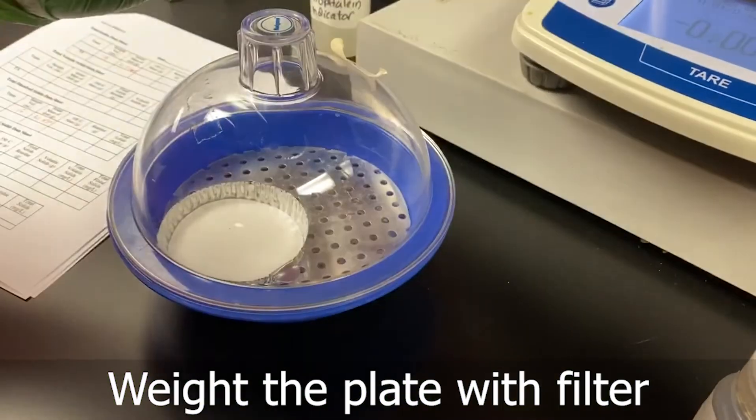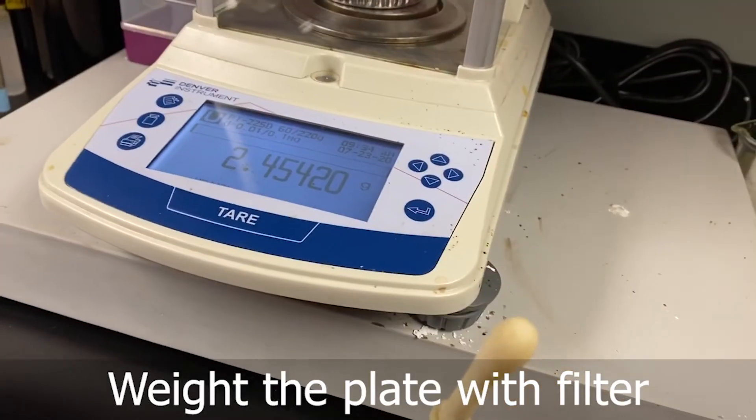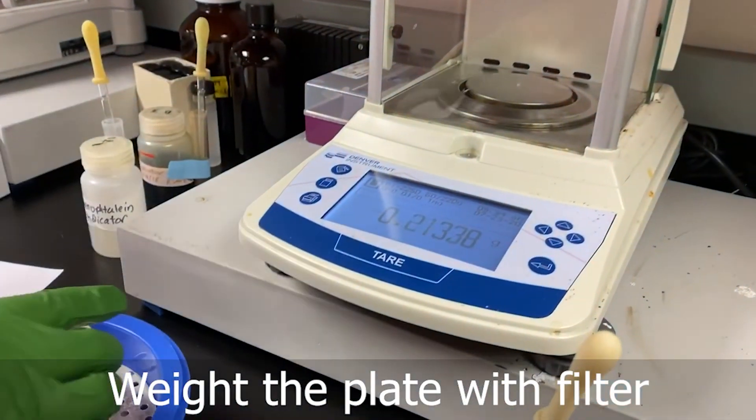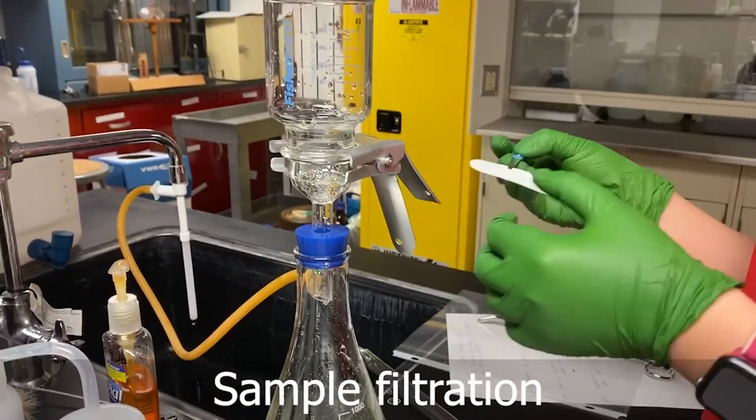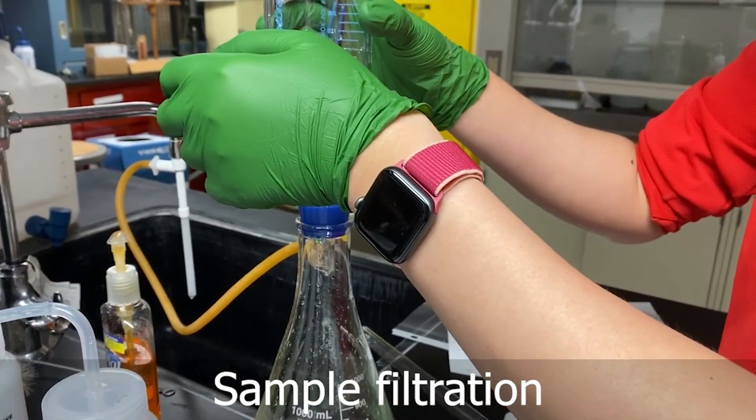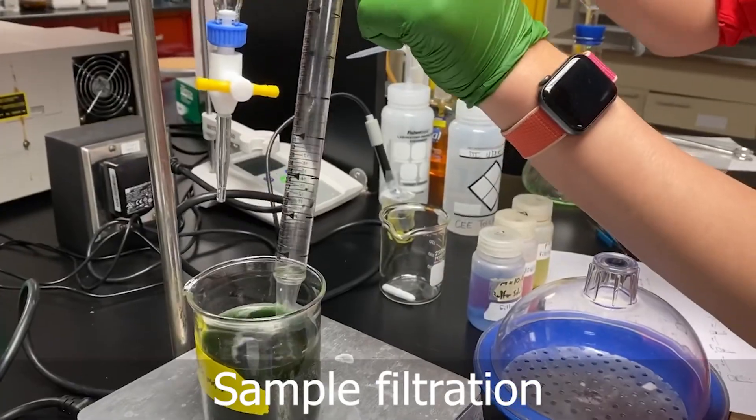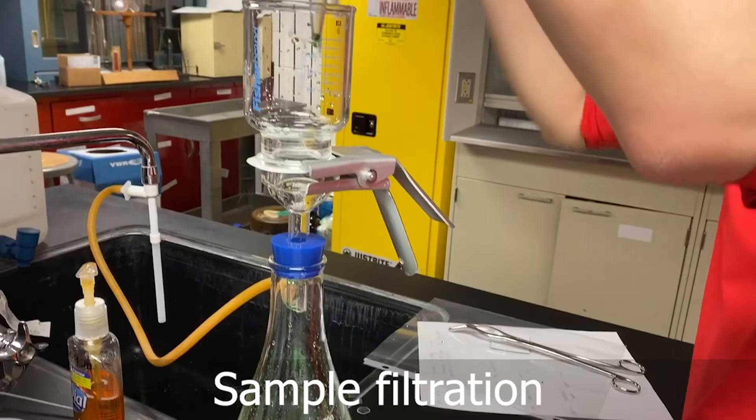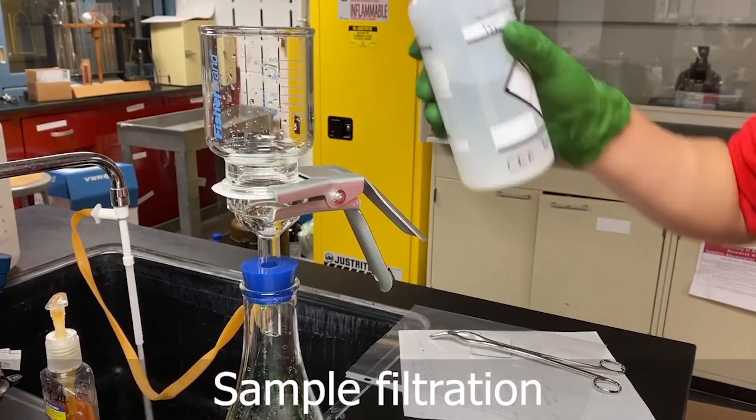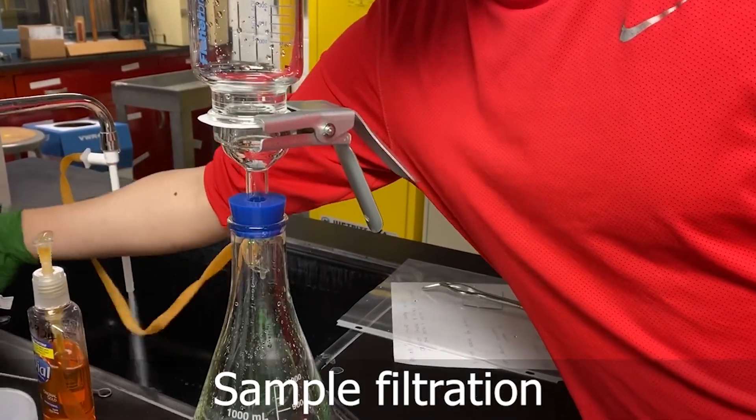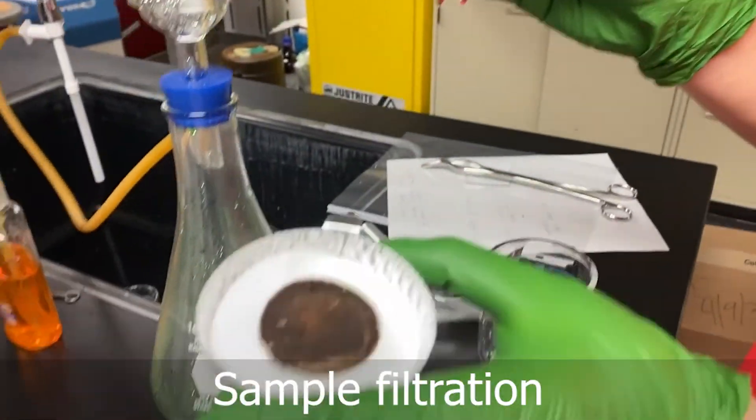So measure the first mass of the first one and then the second one. How do you know what is the first one and what is the second one? Do you have to mark this? Yeah, I can make a scratch on the second one. Then we pour the sample into the filter and after filtering, take the filter and put it into here and then bake it.